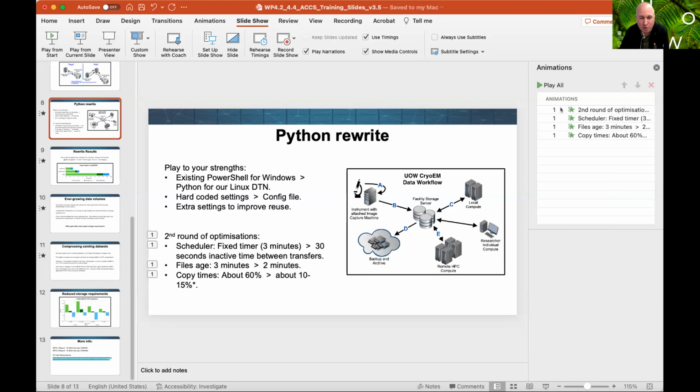No huge, we made this change and it went way faster, and can't really point at any one thing. I suppose we did change a lot of things, and that's often why you'll change one thing at a time and test, and then change one thing and test. We changed a few things, and it could be that things are more efficient on Linux versus Windows, which I'd like to think so, but I'm a bit biased.